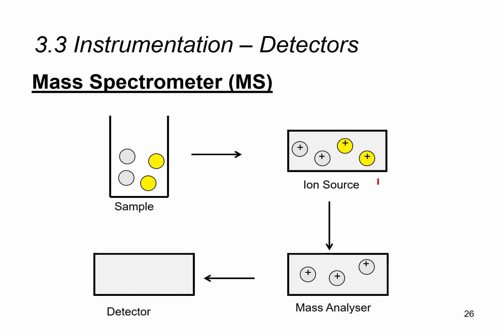Now, since the molecular weights or the molecular masses of every gaseous component are different, the mass spectrometer is able to filter out the molecules of mass that we are not interested in and only retain the masses that we are interested in.